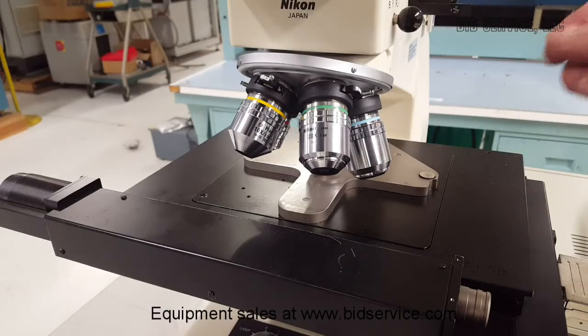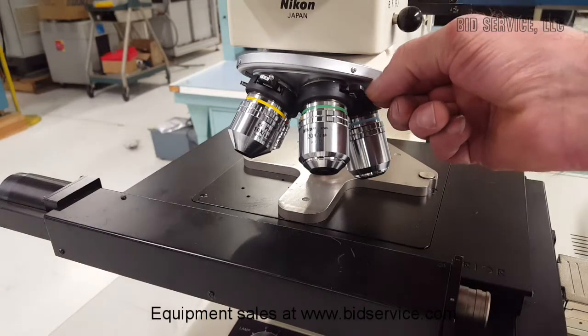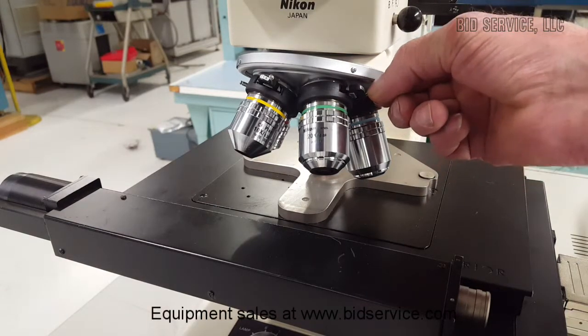This unit has Nomarski Optics. You can adjust the prisms just by pulling them in and out a little bit.